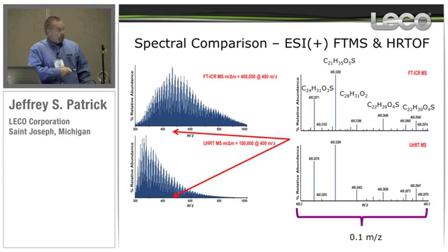So what I've got here is a zoom in of a 10th M/Z window from these two spectra to compare M/Zs and information content. If you don't see an M/Z, you're not going to get an identification. And if you compare the two, FTMS at the top, HR TOF at the bottom, they're all but indistinguishable.